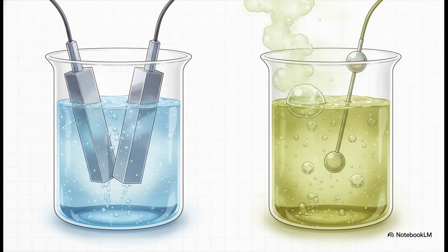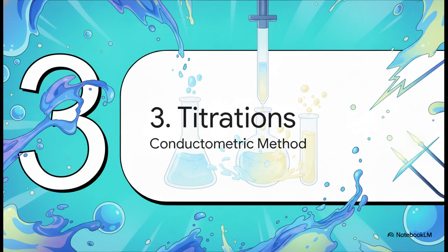So logically, you'd use a probe with a very small cell constant for poorly conducting liquids, like ultra-pure water. On the flip side, you'd need a sensor with a large cell constant for highly conductive stuff, like salty brine or industrial acids.